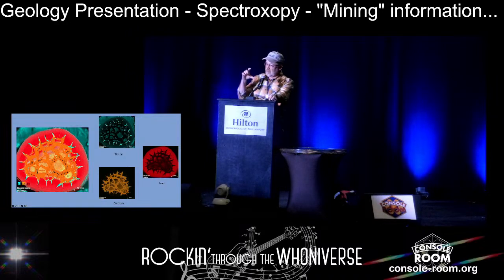Those are usually mudstone with a pattern like this on the interior that's predominantly calcite. And here we have mostly calcite surrounded by iron, but interestingly, the silica, the blue color, is actually quartz. We don't often see that in the septarian nodules.